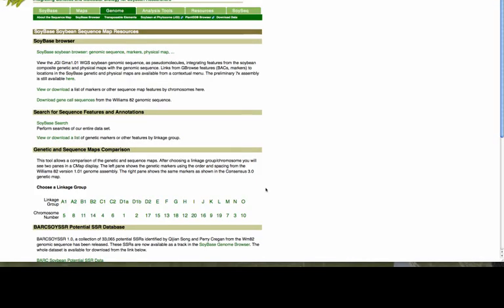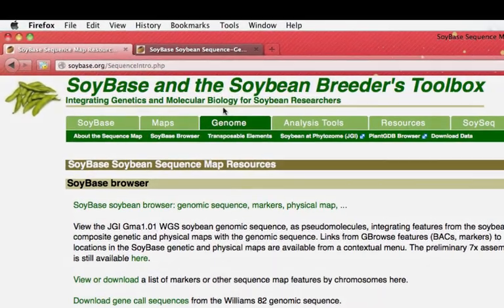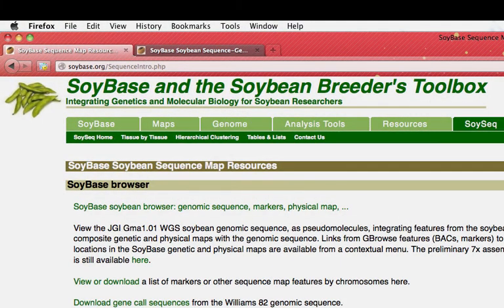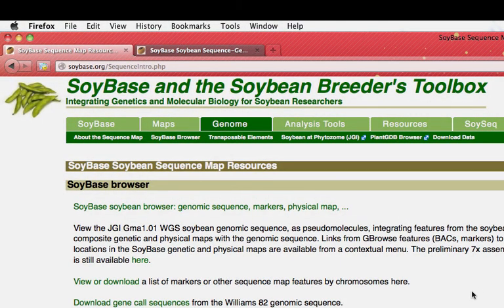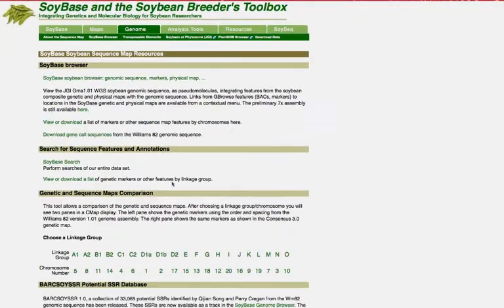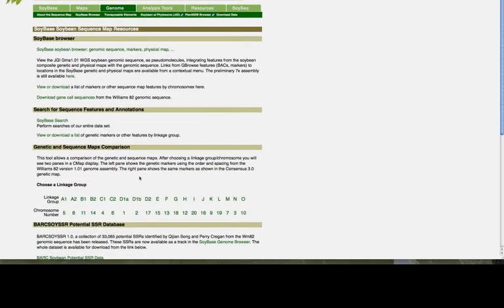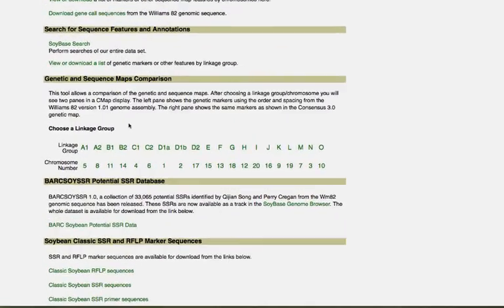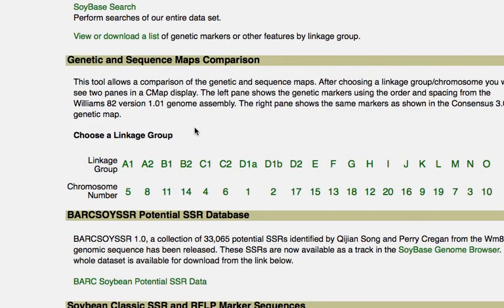How do we compare the genetic map with the sequence map? We have a tool in SoyBase. If you look under the Genome tab, you'll be presented with this view, and if you go down to this section, where you can choose a genetic map versus a sequence map comparison.